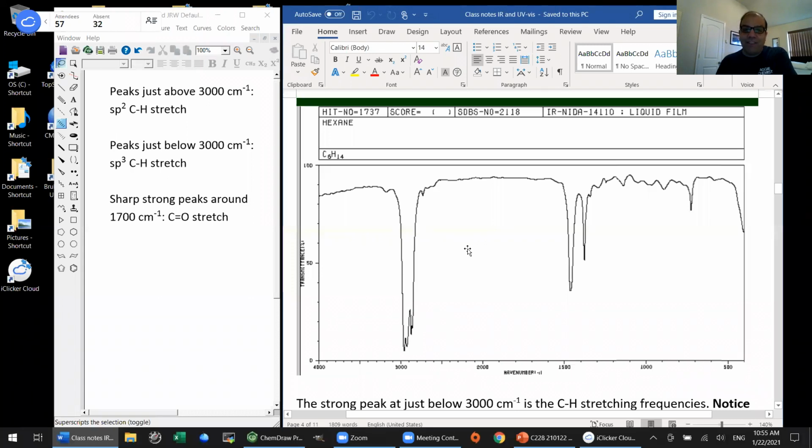So this is about the most blank spectrum you'll ever see. And really this is what I'm gonna do for you guys today. I'm just gonna go through a bunch of examples of IR spectra. There's no time to show you every single possible thing you might run into, but I think we can get through the main ones at least.